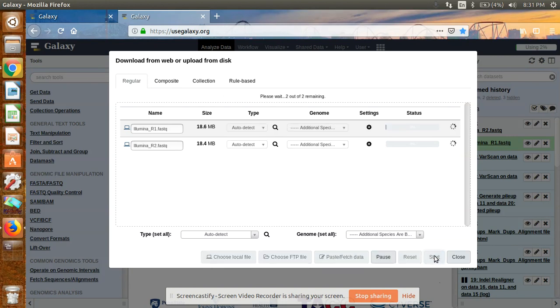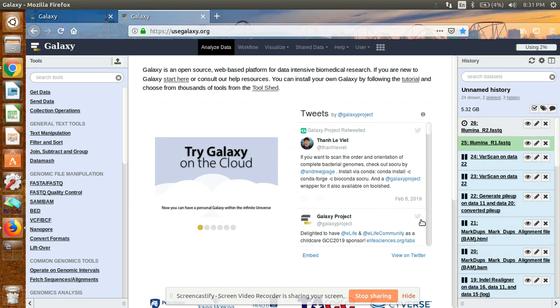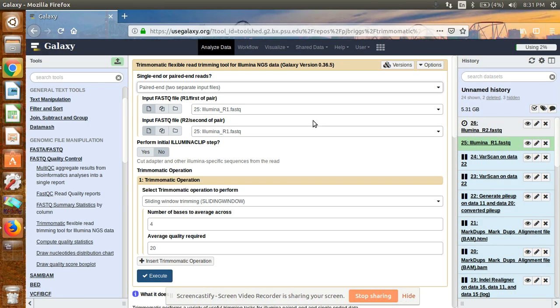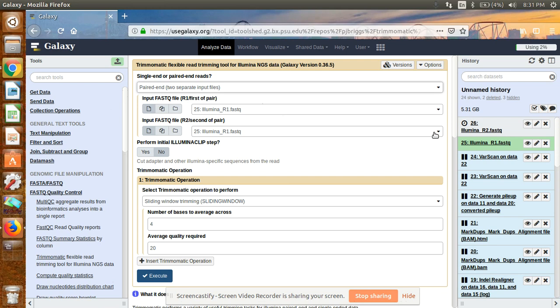It will show a window like this. After that click start to begin uploading the data to the Galaxy server. I have already uploaded the data so I will show you the result. Here you can see the data is uploaded. You can now use this uploaded data for trimming, whether it is single-end or paired-end sequencing.